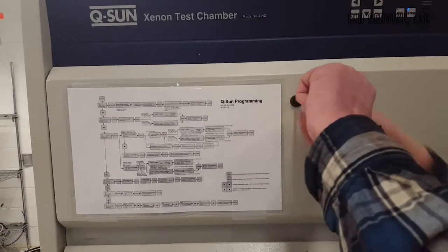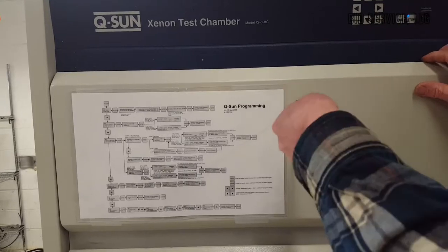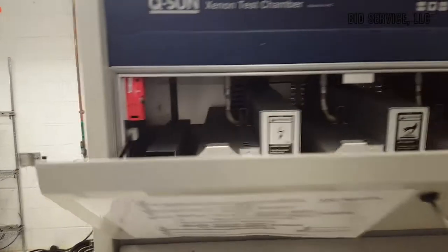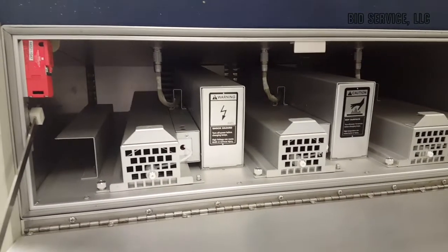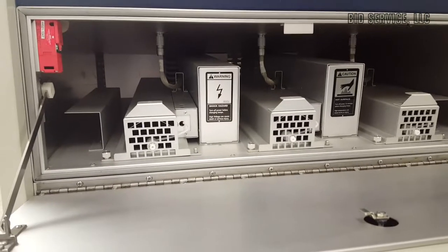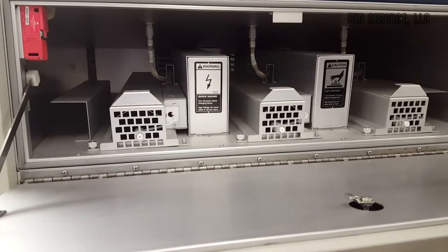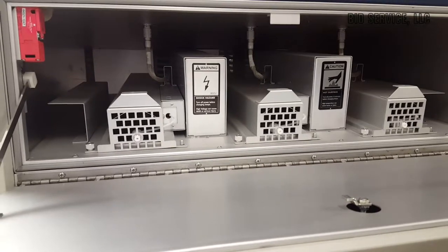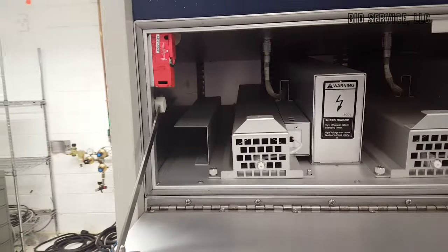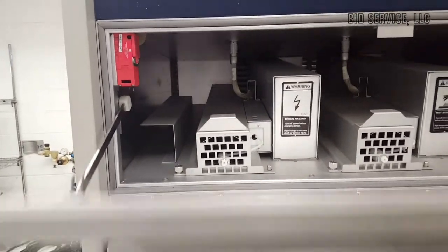This is normally kept closed and locked. But this is where the Xenon light power supplies are kept in here. Normally, there's no servicing involved in this. It's a very, very clean unit. It is also interlocked as well, so if you open it, it shuts everything down.